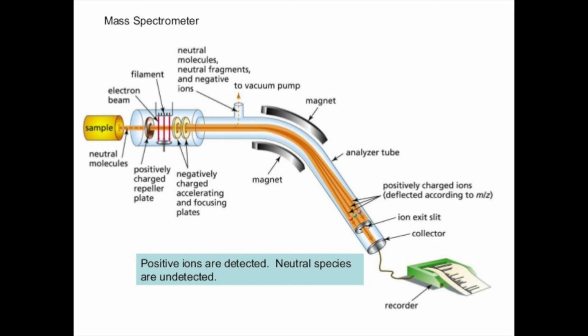A mass spectrum is a plot of the ion signal as a function of the mass-to-charge ratio. These spectra are used to determine the elemental signature of a sample, the masses of particles and of molecules, and to illustrate the chemical structures of molecules.